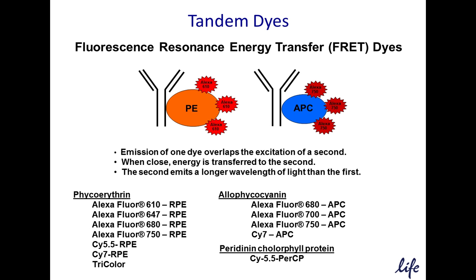This is a graphic representation of a tandem dye and a listing of some of the common tandem combinations available. There are advantages to using tandems. They are very useful because they open up new regions of the spectra in the far red area. They have a large Stokes shift and allow for more options within a single laser line.